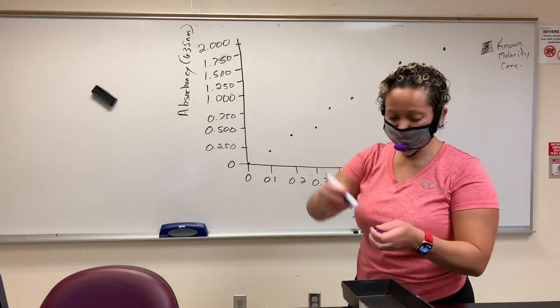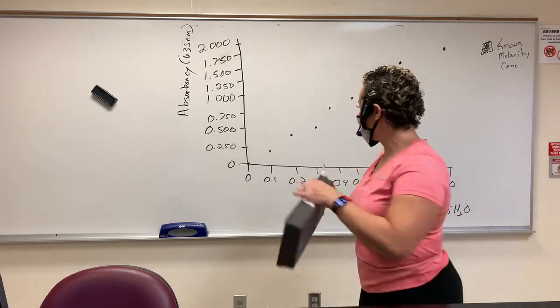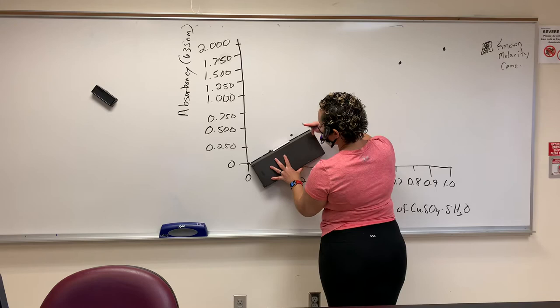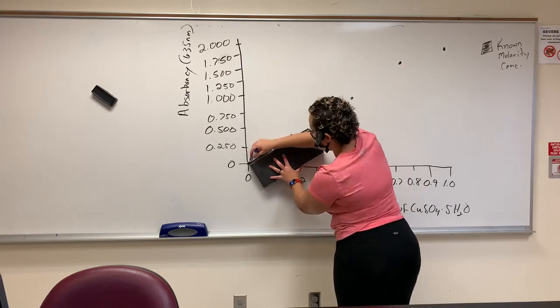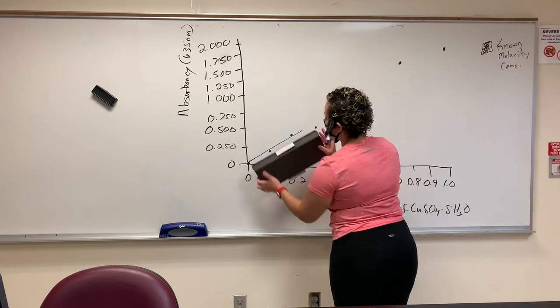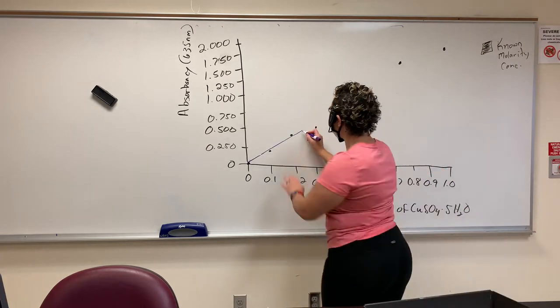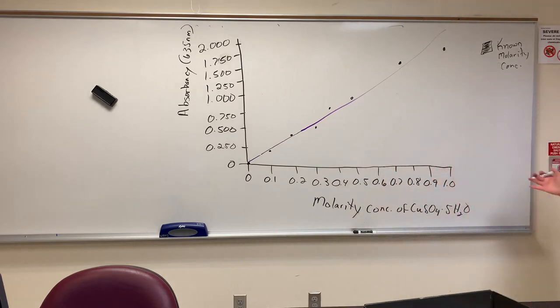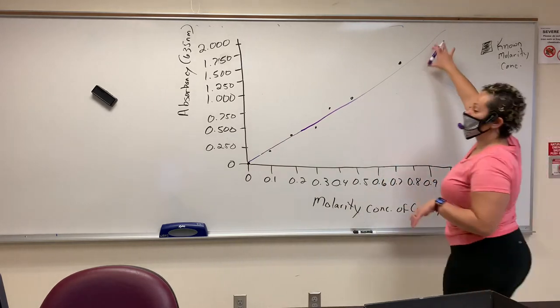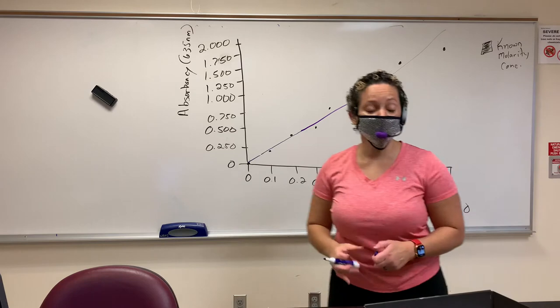I had meter sticks in my other lab thing, and I just didn't bring one in. So you're going to go ahead and put it in the middle of the data lines. We're not playing connect the dots, okay? So that was to illustrate that I'm putting it in the middle. Woo-hoo! See, it does not connect the dots, and that's terrible. That's why I use a ruler, okay?